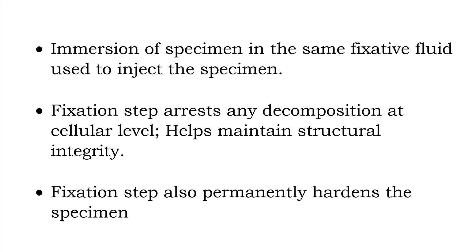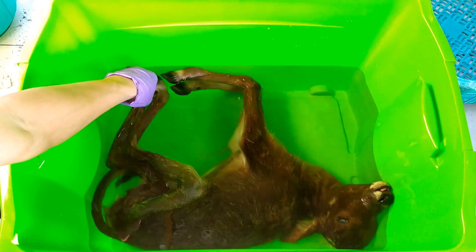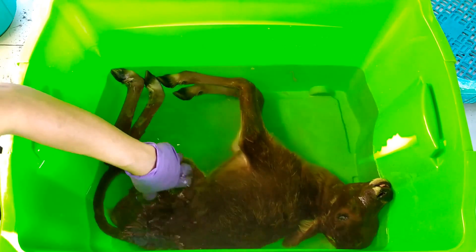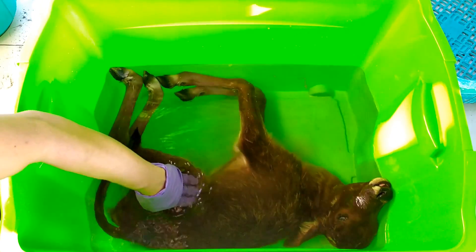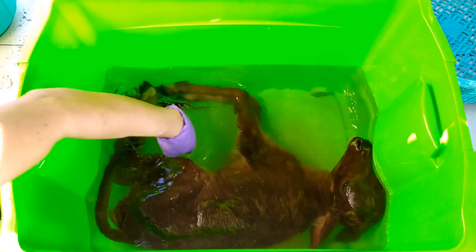You may use various tools such as pins, threads, and hooks to spread out the specimen if need be. This calf specimen was already in the posture I wanted, so there was no need of rearranging it. To fix the specimen, all we have to do is immerse it into a large container filled with 10% formalin, either buffered or unbuffered, of the same type used to inject the animal. The specimen should spaciously fit into the container without cramping and should completely immerse in the fixative fluid, so use a liberal quantity. As we immerse the calf, a good quantity of air bubbles can be seen coming out through the slits made in the rib cage — a good sign that the cavities inside are thoroughly filled with formalin solution, ensuring proper fixation in and out.